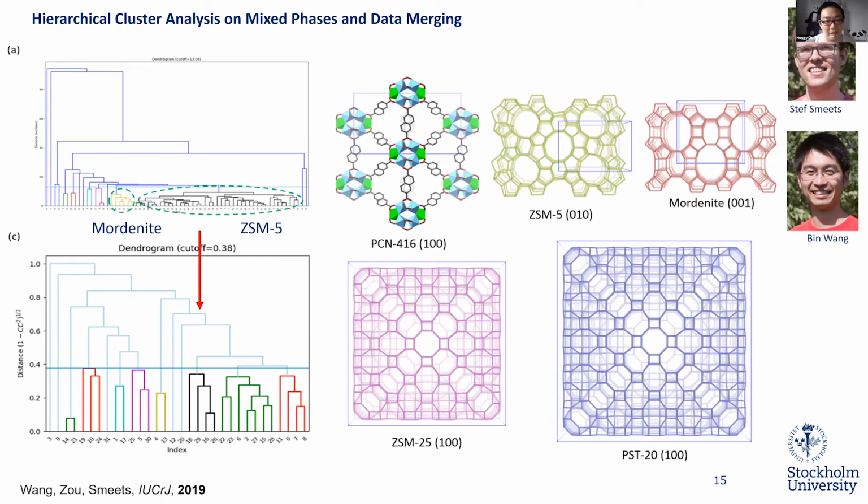And by doing this, we can just use Instamatic to automatically collect data and then process and cluster all this data afterwards, and we can distinguish different structures. In this case, zeolites and mordenite, those materials. It's doable with this clustering process.